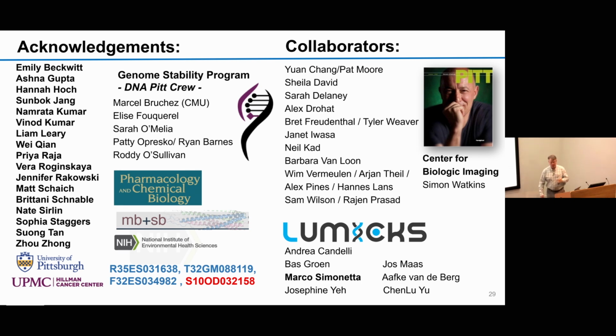Hello, I was just wondering whether you tried the zinc finger 3 and the WGR domain of PARP1 in your binding assays. Not yet. But you're planning to do that? Yeah, we're going to march through all the motifs. Also, when you separate zinc finger 1 and zinc finger 2 from the full-length protein, do they behave similarly to the full-length protein? Yeah, the KD was almost identical. You could see that it's sampling the nick with almost the same kinetics as the full length.